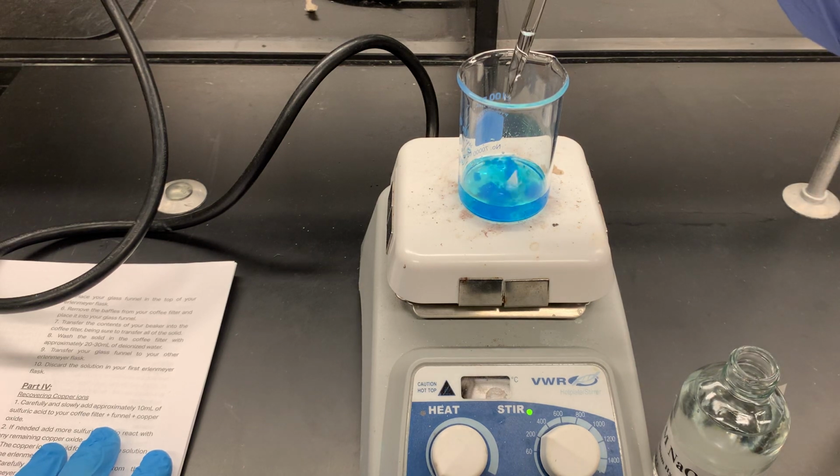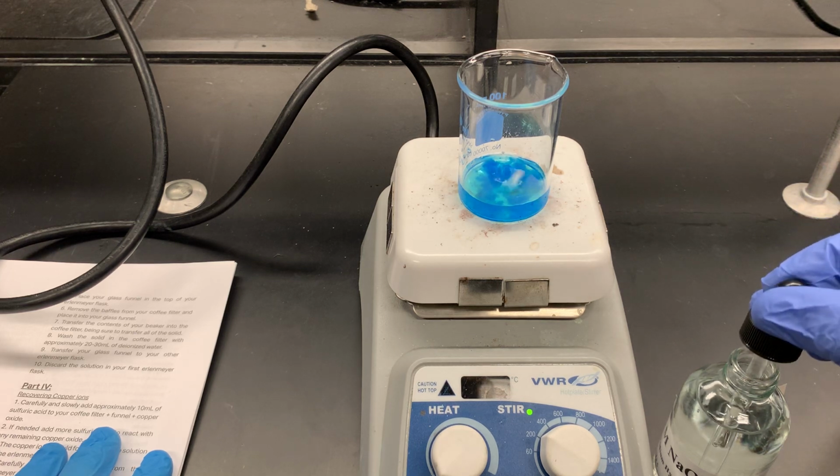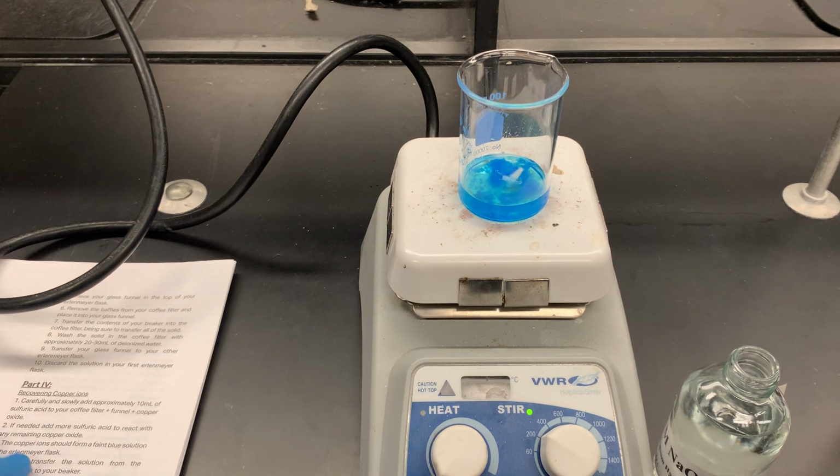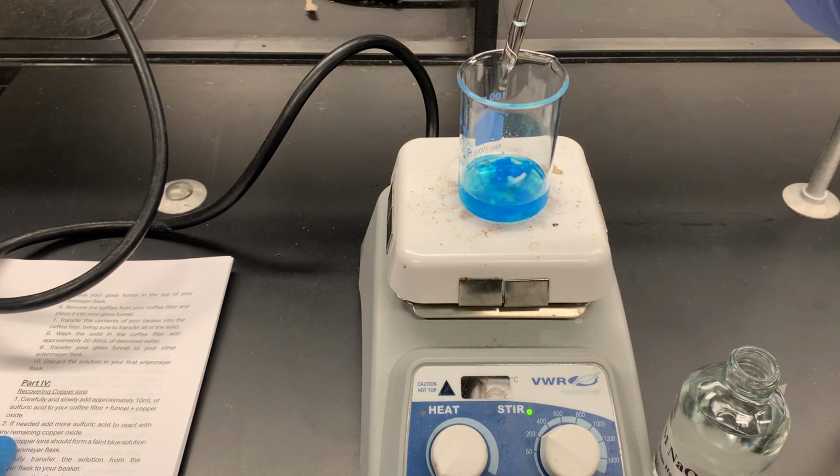Okay, I want to continue adding my sodium hydroxide. And I'm going a little bit above that dropwise fashion. And I've gone from 5 to 10 drops to 15. And now I'm adding what I think are approximately 20 drops at a time. And so I've done that basically 3 times.